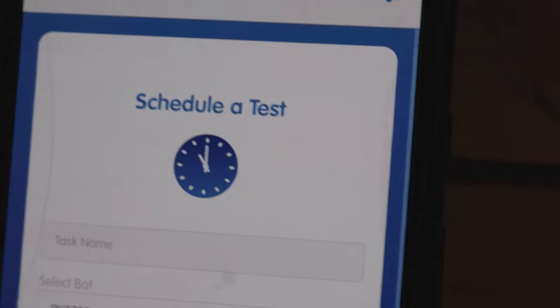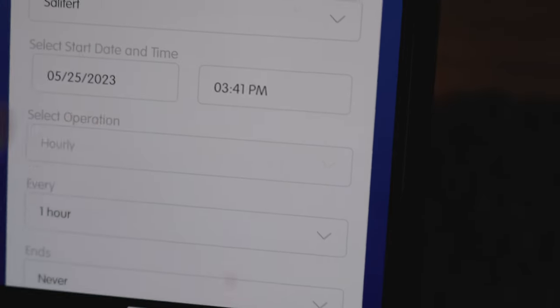So what's really neat about Reef Kinetic is they are constantly adding new test kit brands that work with your ReefBot Lab, and they're always testing and developing new brands. So there's a lot of use and capability of having a ReefBot. A lot of benefits to having a ReefBot Lab. As you can see here, you can test for multiple parameters. So maybe you're going through the beginning stages of your reef tank. You want to set up ammonia, nitrite, and nitrate, and you want to schedule those out. And that's a big thing with the ReefBot is that you're able to schedule hours daily, weekly, and monthly, and you can set those tests up so that your ReefBot is automatically doing that. You don't even have to think about it, and then you will get a notification that says the ReefBot has completed a test, and you can look at that test result on your phone using the app.